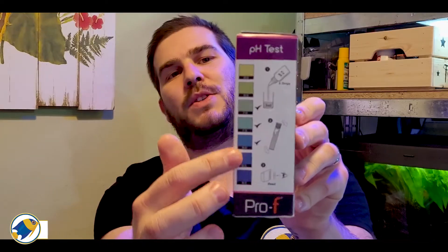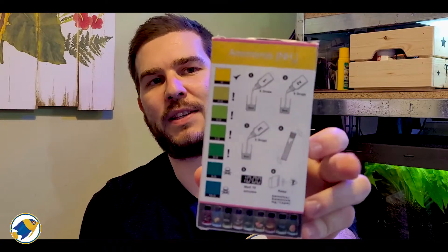For now, this is the mini test kit. I really like the product packaging that NT Labs do — I just feel that they make a real effort on their packaging. With this test kit specifically, it gives all the measurements for what you're looking for when you do each test. This kit only tests for three different things: ammonia, nitrite, and pH. The other test kits would test for water hardness, carbonate hardness, and nitrate, but these three are the quite important ones you really need to test for.